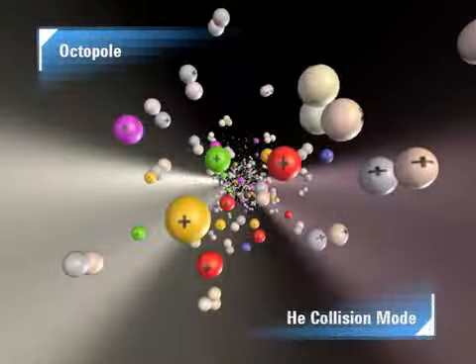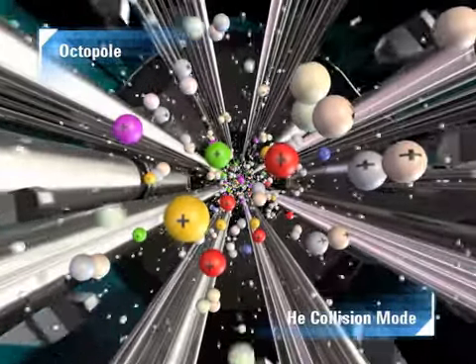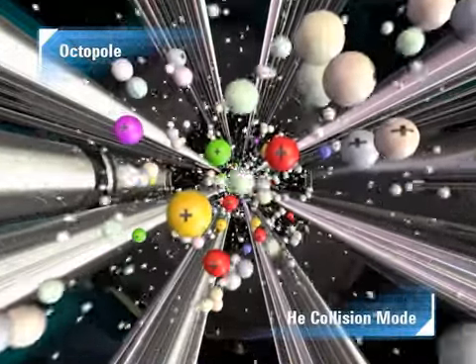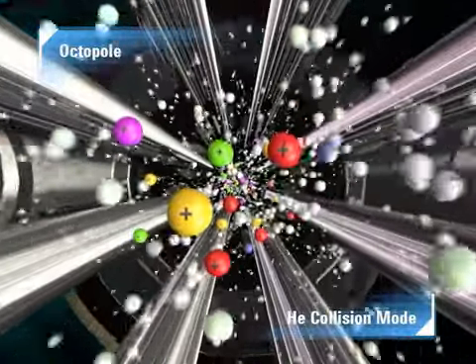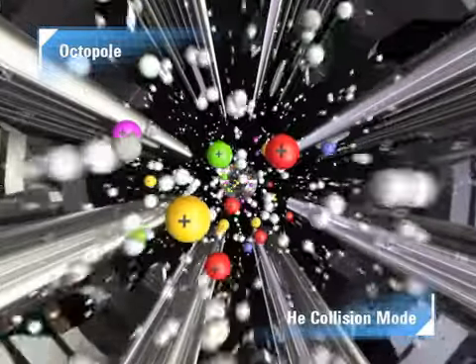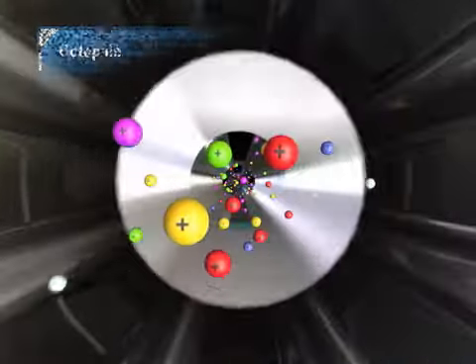The larger polyatomic interferences collide more often with the helium atoms than the analyte ions and lose more kinetic energy. A potential barrier at the cell exit allows only the higher energy analyte ions to pass through to the mass analyzer. The low-energy polyatomic ions are prevented from leaving the cell by energy discrimination.